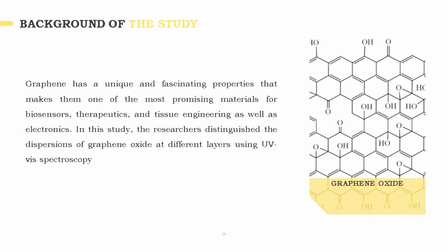This method was utilized to study the surface film formation of graphene and its oxides that is relevant in many applications such as biomedical and electronics. Though some previous studies used characterization techniques such as atomic force microscopy or AFM, Raman spectroscopy, and transmission electron microscopy, this study was carried out through the UV-vis method that measures the percentage of few-layer sheets in graphene oxide dispersions efficiently and in an inexpensive way compared to the aforementioned techniques.